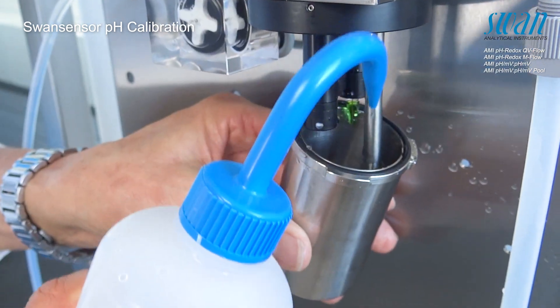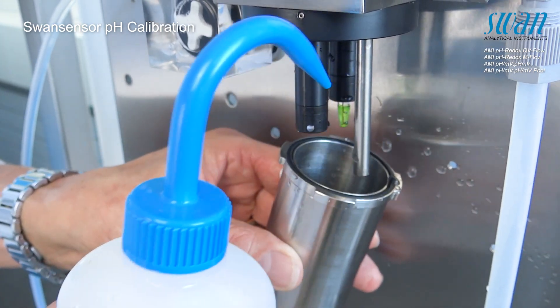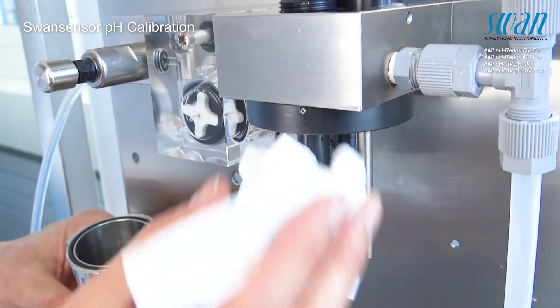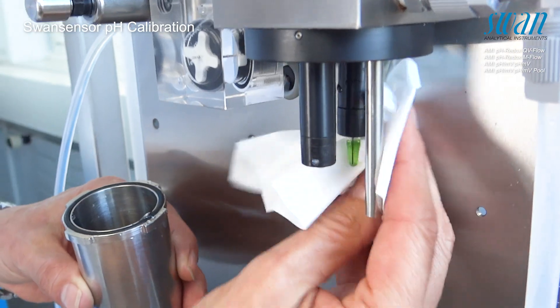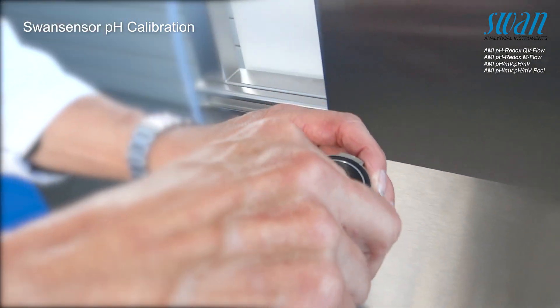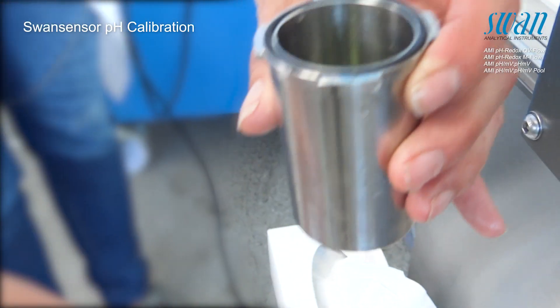Rinse the electrodes with deionized water and pat them dry with a soft paper tissue. Rinse the calibration vessel with water and standard solution 1 with pH 7. Next, fill standard solution 1 into the calibration vessel.